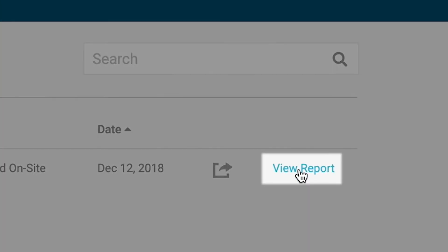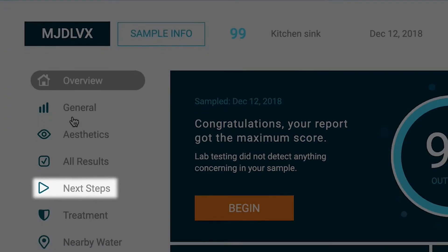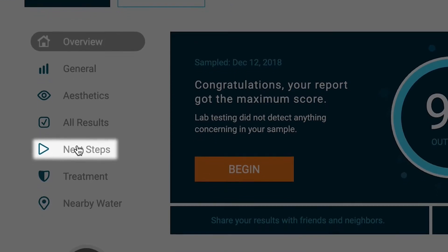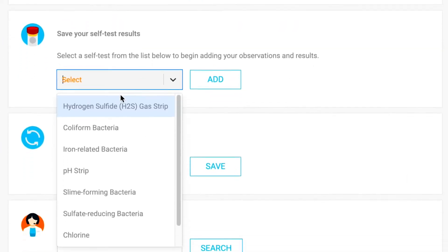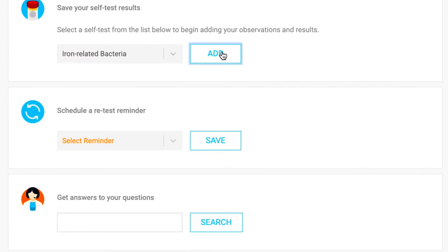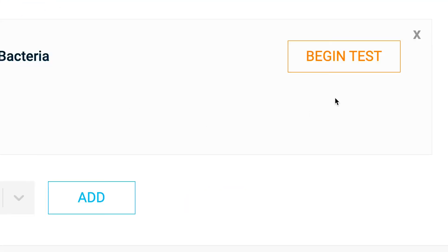Open your report and choose next steps. Here you can save your self-test results. Select and add the appropriate self-test to get started.